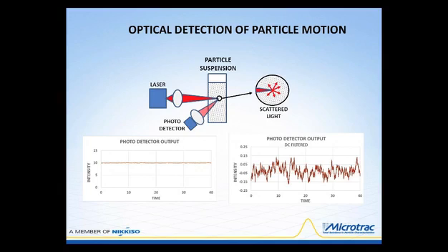The enlargement there shows the focal point of the laser with a random scattering of light. The angular direction that the photodetector is set up at will pick off just that angle.